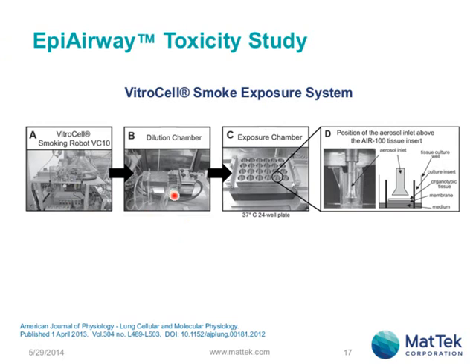The diluted smoke is then moved to the exposure chamber, which contains the EpiAirway tissues. So the tissues would be found in each of these wells that you see here. The smoke is exposed to the apical surface of the tissue through the aerosol inlet, which sits just above the apical surface of the tissues. So in this study, tissues were exposed to smoke for up to 28 minutes and then allowed to recover for up to 48 hours, during which at different time points the gene responses were analyzed.